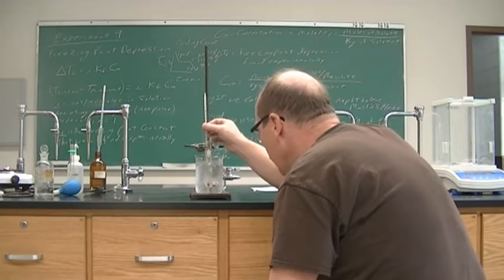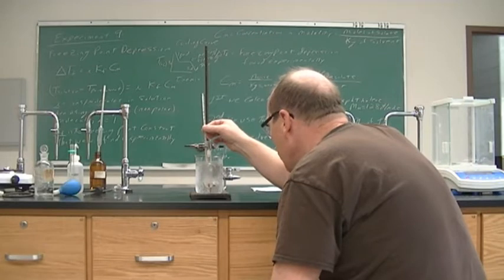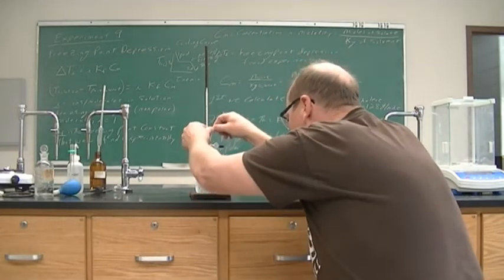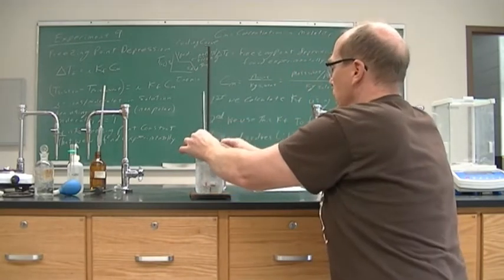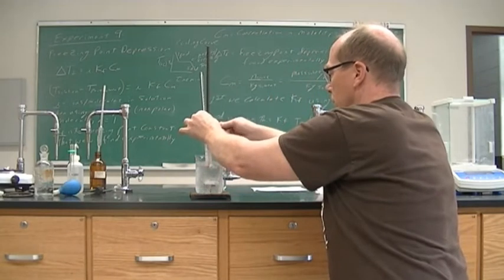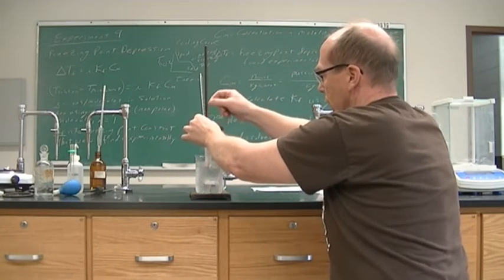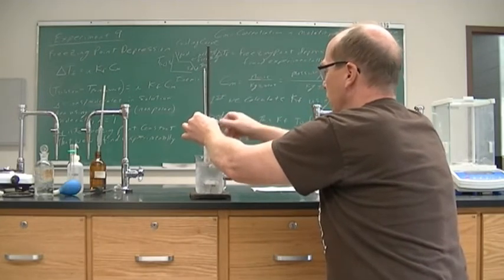All right, another 15 seconds, and we are at 5.5. Not sure how that went down so fast. 5.5. And also at this point, I see that, pull it out of the solution, that we have solid. So now we have solid. There is solid in here. And so I'm going to bring it up out of here.